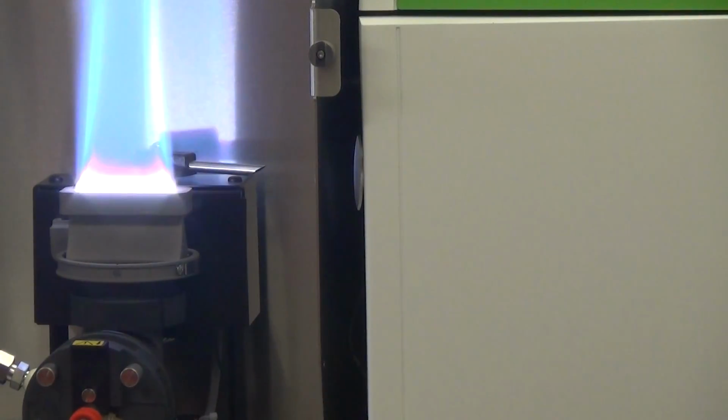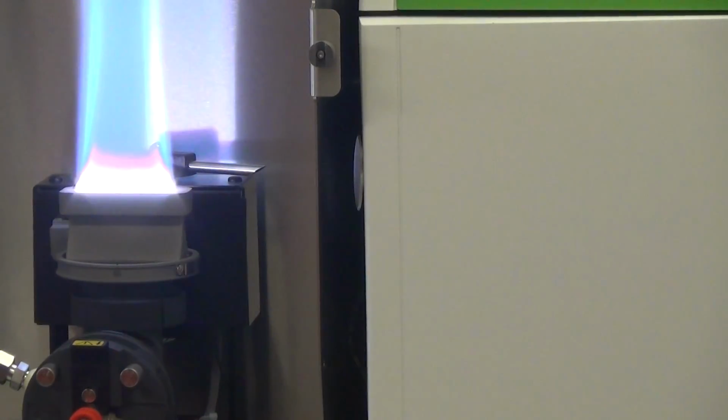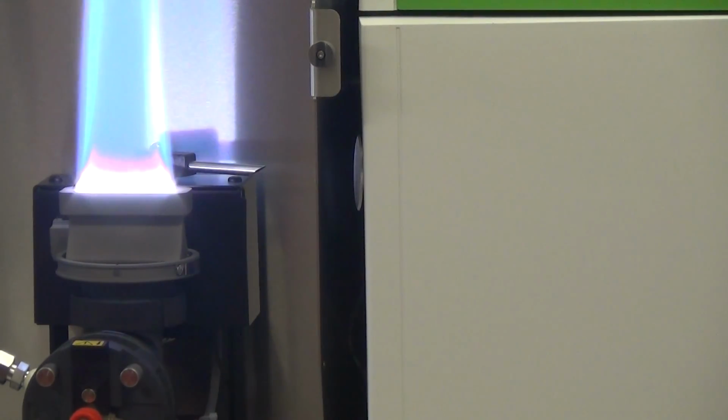Right now, if I was running a nitrous oxide element, I would go to continuous graphics, and once I've got that, I would start dropping the burner head, because now we have the light right at the top of the head. I want it up there, so I would stop. Yeah, because you want it in the red zone. I want it at the top of the red zone because nitrous oxide is temperature sensitive and I need more temperature. I've got 33% oxygen versus roughly 20 for air, the same thing it does for a car. It helps it burn hotter. Then in continuous graphics, as I drop it, I will see the absorbance go up, and I'll get to a certain point, just like any of these adjustments, where I'll start to see it go back down again. I'll come back to that point, and then I'll make 1 or 2 clicks, one way or the other, for flatness.